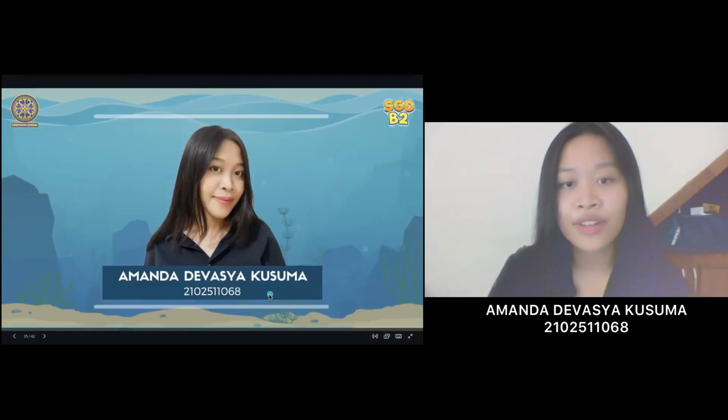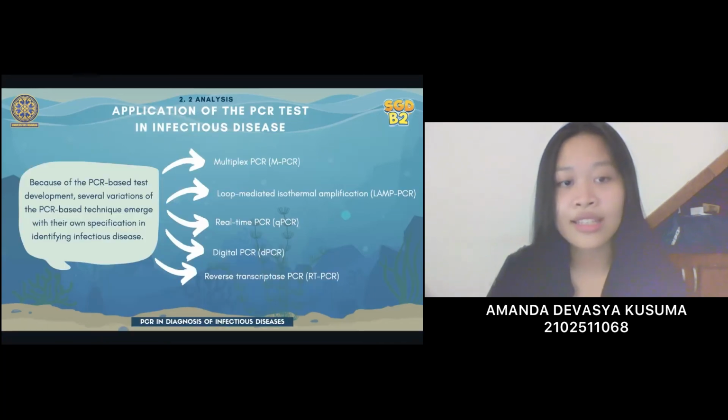Now I will continue the presentation. So next is dPCR or digital PCR. dPCR can detect virus even in a very low viral load and low concentration of sample. dPCR could be used in the diagnosis of many infectious diseases caused by bacteria to parasites such as HPV, human influenza, HIV, Plasmodium vivax, and etc.